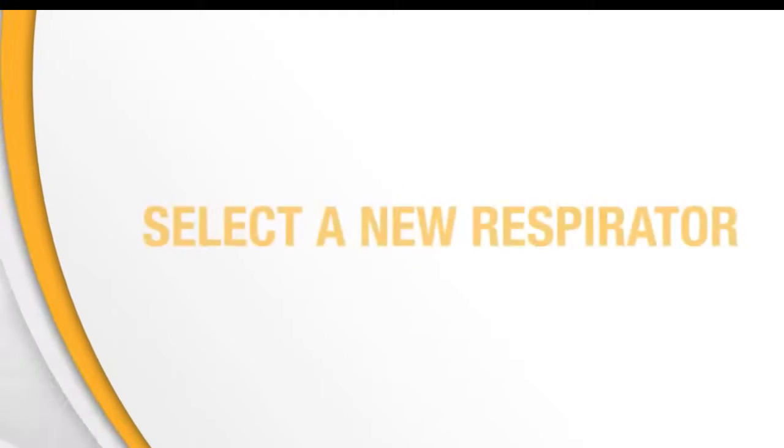If at any time during the fit test you detect the same taste you did during the sensitivity check, inform the instructor immediately. It means that your respirator does not fit properly. You must then refit your existing respirator or select a different size or style of respirator.